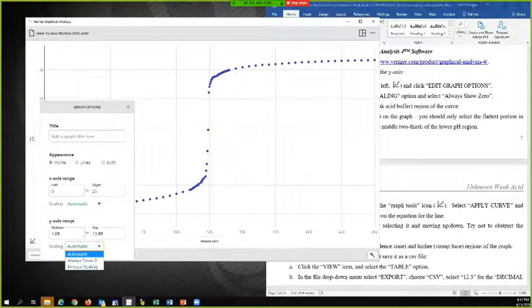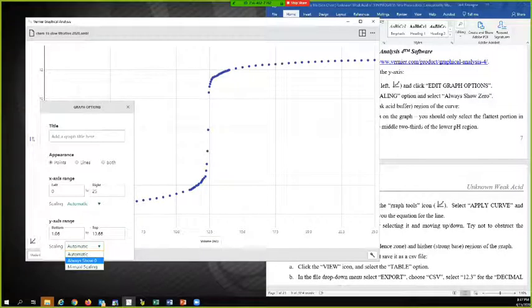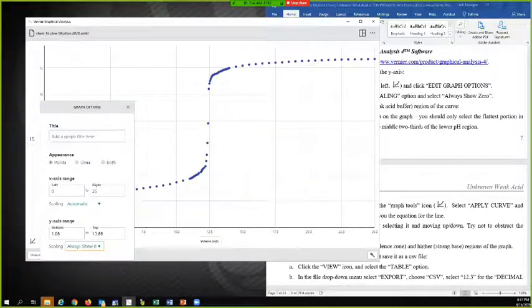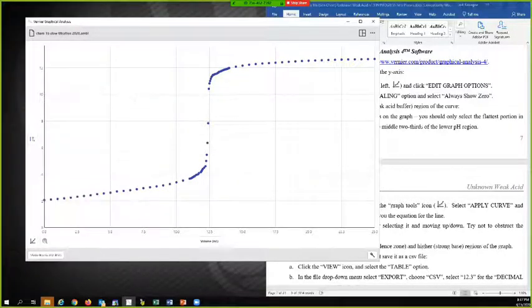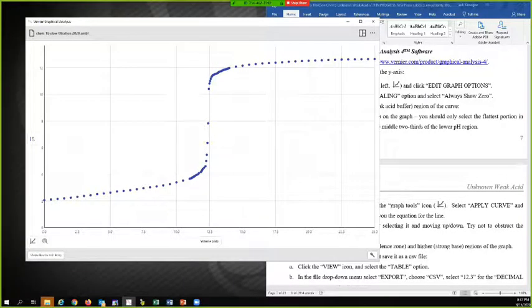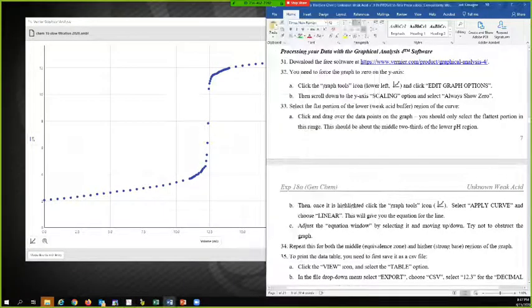And under scaling, I'm going to choose always show zero. And I'm going to close that. Now I can see where zero is.